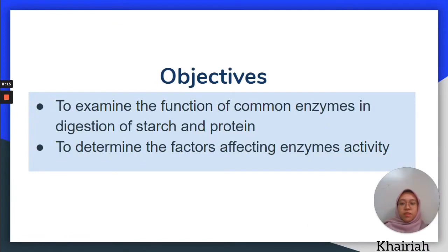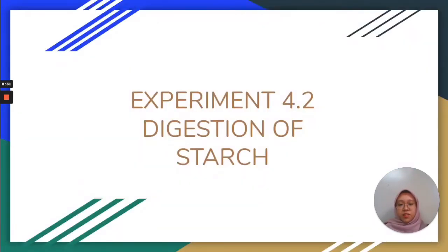The objective of this experiment is to examine the function of common enzyme in the digestion of starch and protein. And the second one is to determine the factors that affecting enzyme activity. First experiment is the digestion of starch.